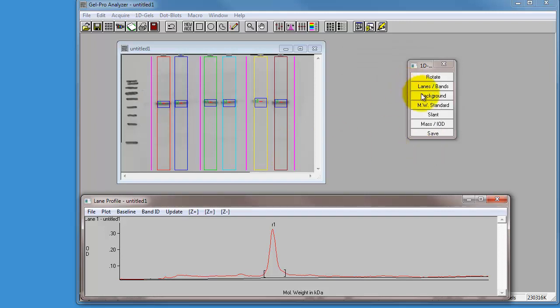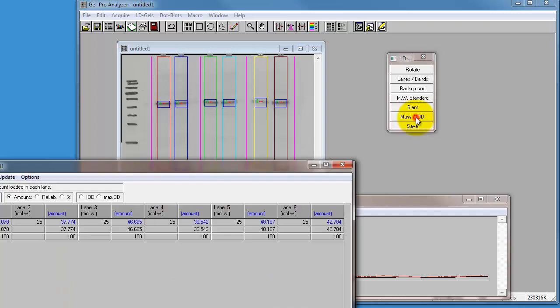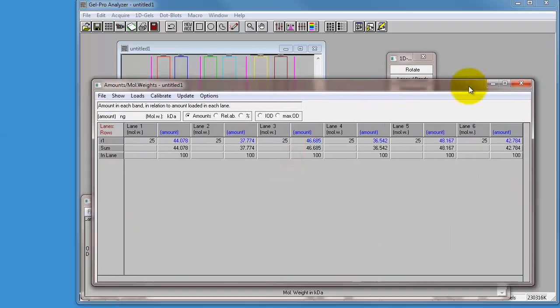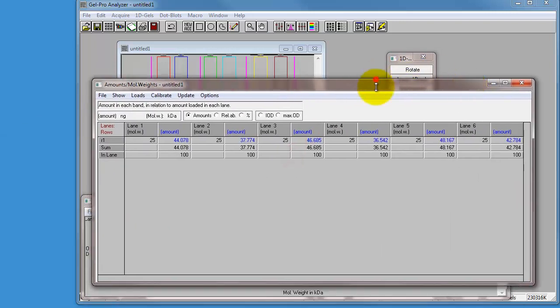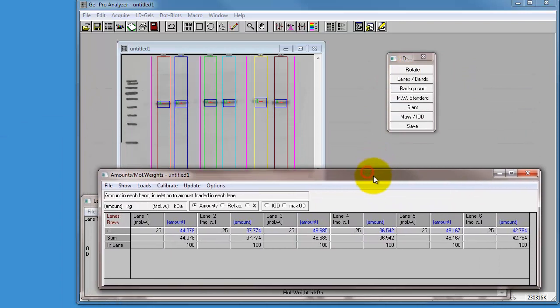If you've got molecular weight standards and you want to work out the molecular weight of a product, you can do that. I'm not going to do that now. I'm just more interested in working out what the density of each of these bands are. So I click on the mass IOD. Mass meaning mass and IOD meaning integrated optical density. So I click on that, and it brings up this rather complicated and busy spreadsheet.